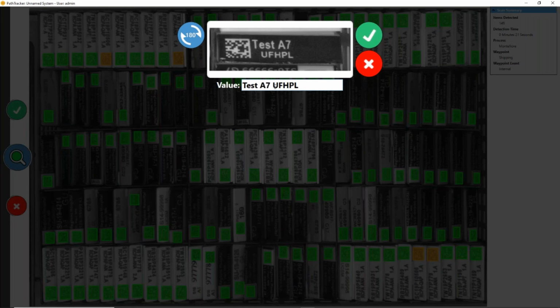We thought this was probably a last resort because the human readable characters do not contain all the information that's in the barcode, but we were surprised to find that some national labs found this very interesting. Apparently, they get a lot of cassettes shipped to them, a lot of them overseas shipments, where they come in and there are no barcodes. The information is just handwritten on the end of the cassette. So they found this to be pretty valuable.